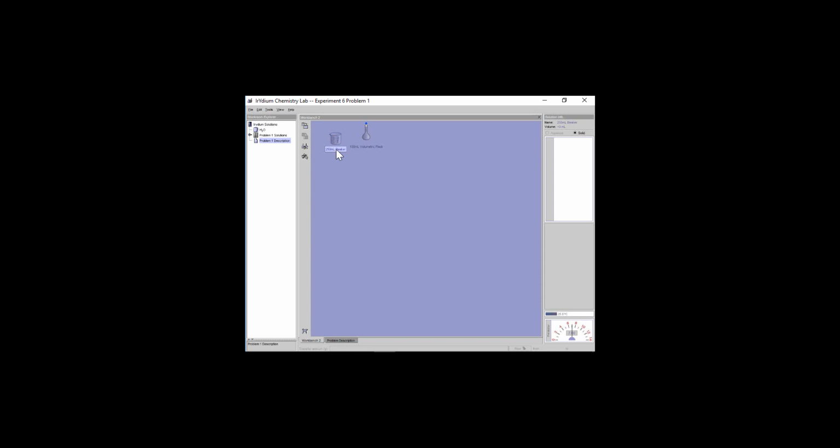So I do want to demonstrate to you the proper technique of making a solution here. Volumetrics, even though they do only have the one single mark, have been really well calibrated. By the time you add water to that mark, the bottom of the meniscus hits 100. I know it's exactly 100.00, 2 decimal places, volumetric class. So I'm going to pull up my solutions here on the left sidebar. I have my KHP, my acid, as well as my NaOH. My first titration is going to be between KHP and NaOH. So let me just pull those 2 out first.